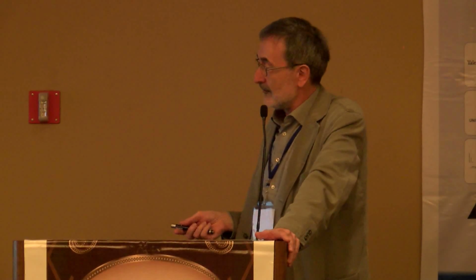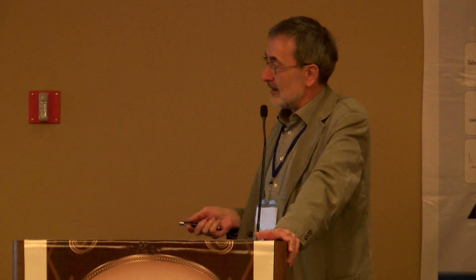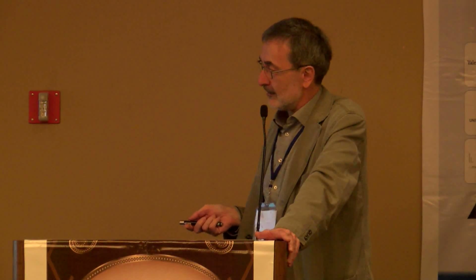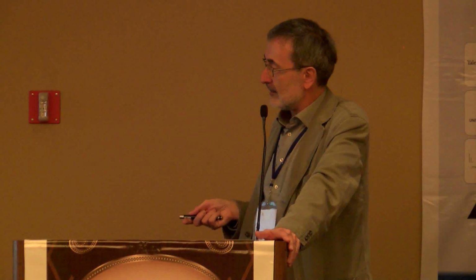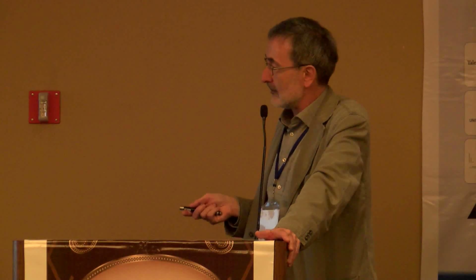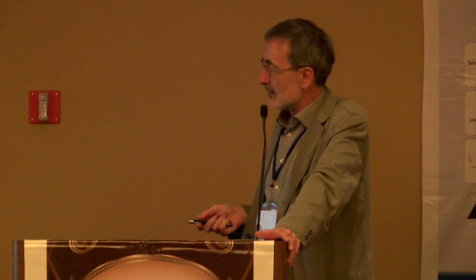The next projects are using laser microdissection to sample certain tissue and plant cells. There was a paper in 2005 by people from the Max Planck Institute in Golm, who reported that they cut vascular bundles from Arabidopsis plants, recorded mass spectra, and detected a number of primary metabolites, such as sugars and amino acids, within these vascular bundles.